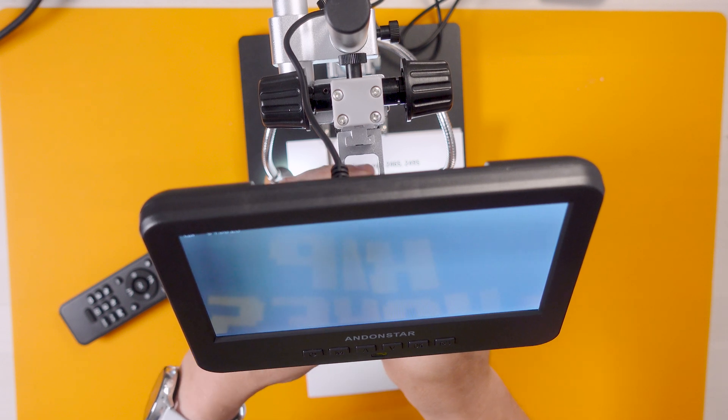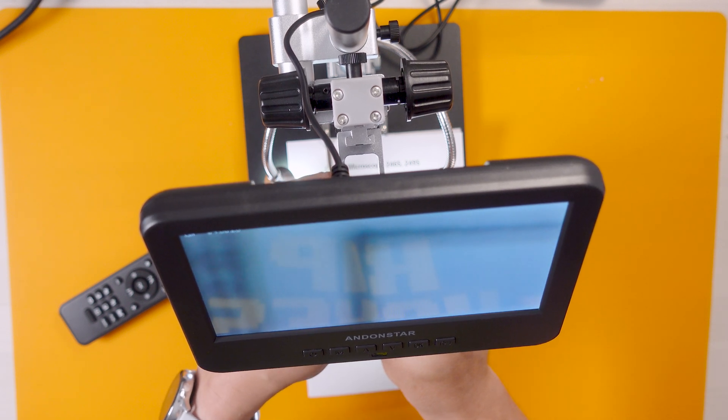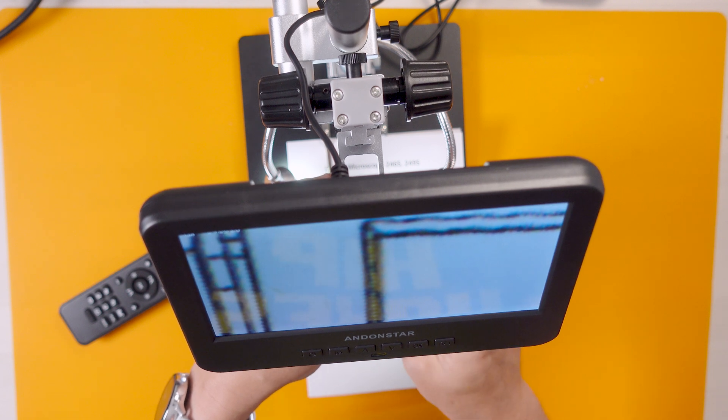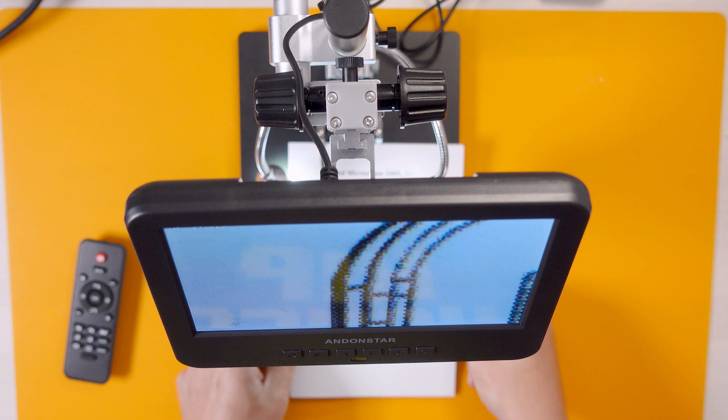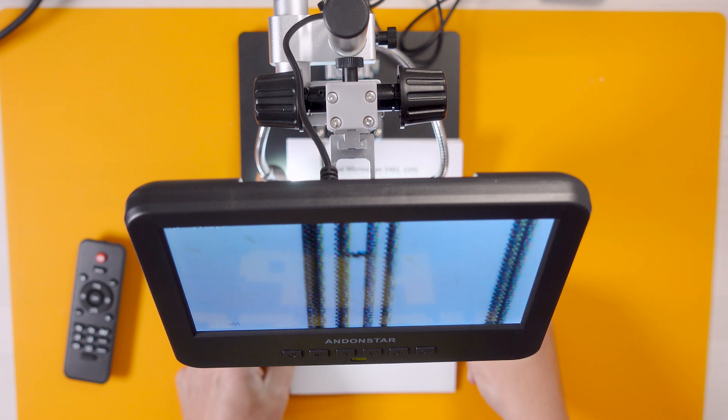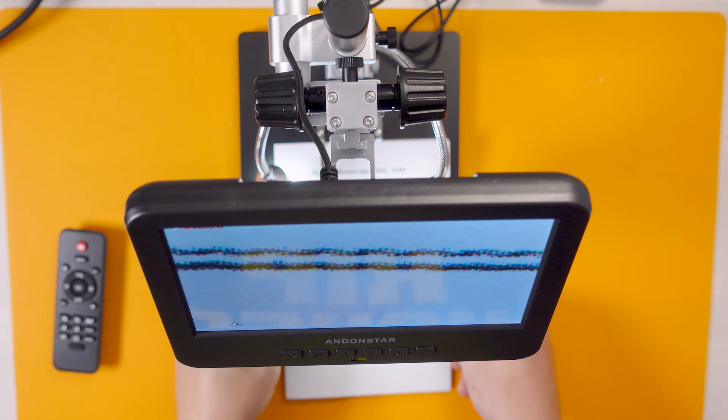So now it's just a bit of trial and error. Oh my God — it actually works! You can see the individual dots. The remote control has got batteries in and I managed to get this to record. You can actually see the dots that make up the printing on the brochure. It's amazing.